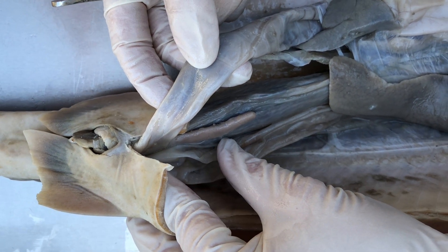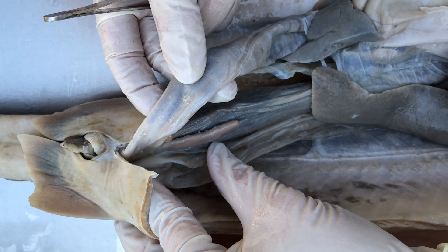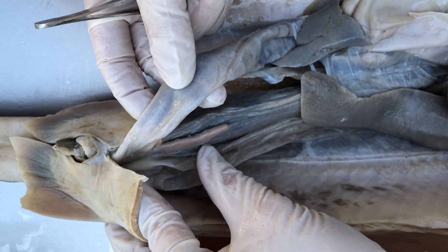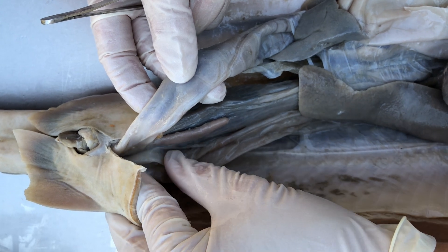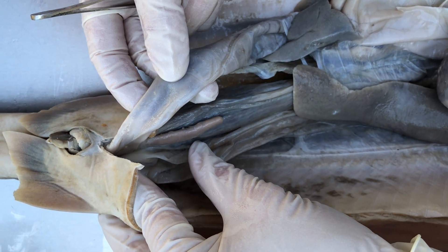It's actually involved in regulating some salt balance, and it's called the rectal gland, which makes a lot of sense because it's draining into the rectum. The rectal gland — forgot to mention it.